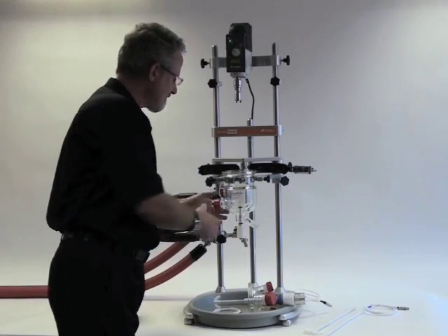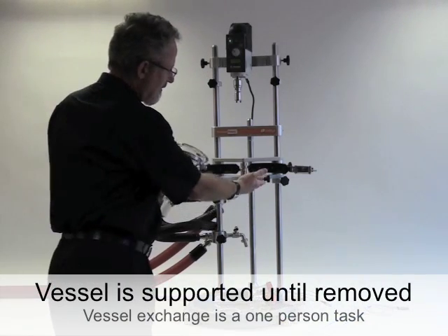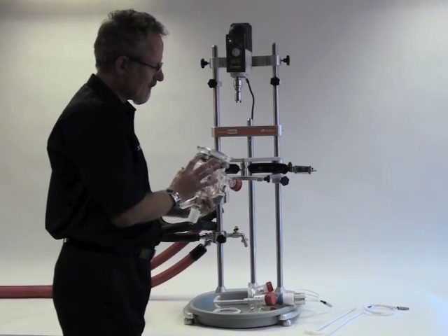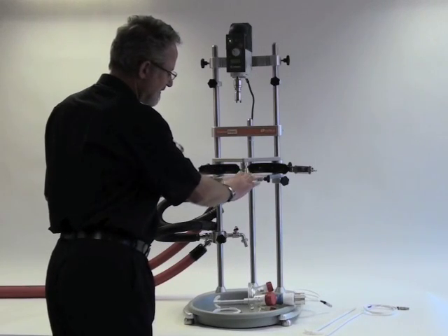Now I can remove the vessel. The vessel is supported in the frame by this stainless steel support collar which has three lugs, and these locate in recesses in the support.